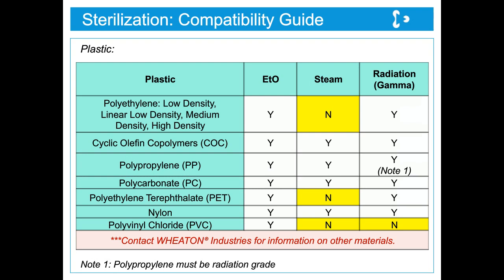Now again, this isn't all the plastics. There are many more plastics. There's cyclic olefin polymer, and you could go on, PTFE, there are many more. But if you want a list of how the sterilization method affects a specific plastic that you may be working with, again, please reach out to me, and I'll get an answer to your question.